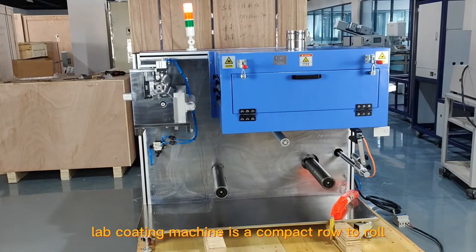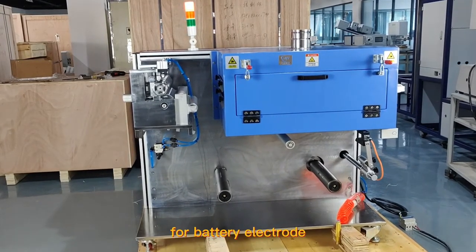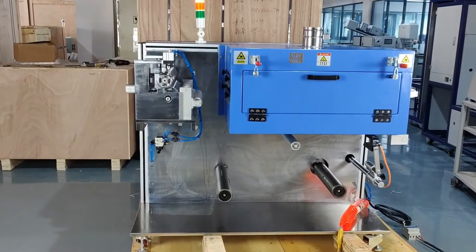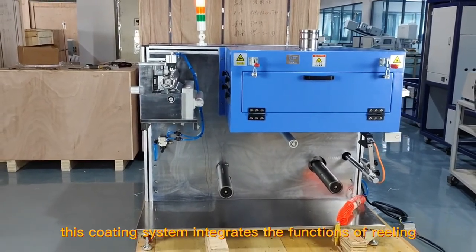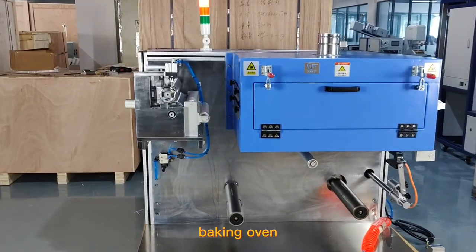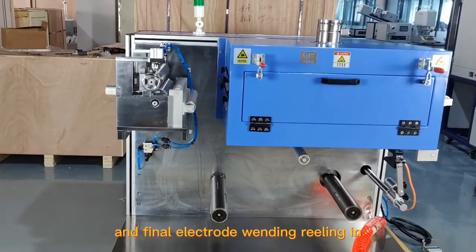The Lab Coating Machine is a compact roll-to-roll continuous coater for battery electrode sheets, designed for battery research labs. This coating system integrates the functions of reeling in and out, slurry feeder, coating blade, baking oven, and final electrode winding reeling in.